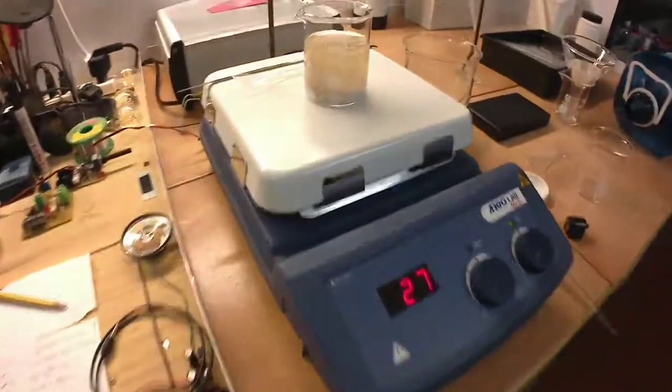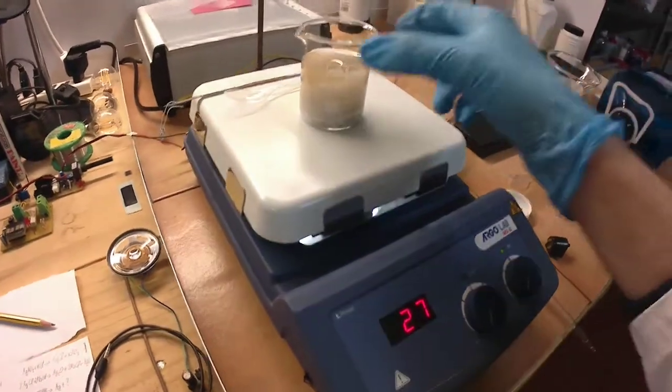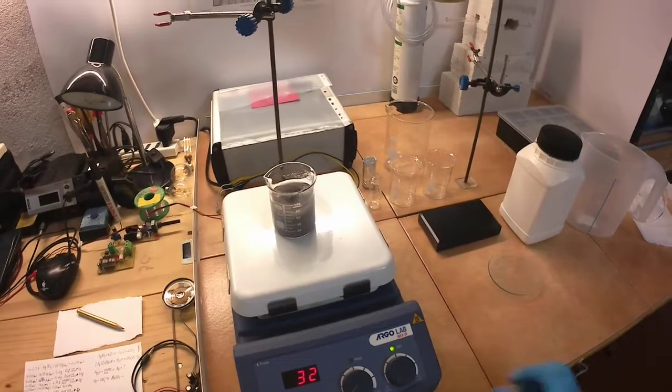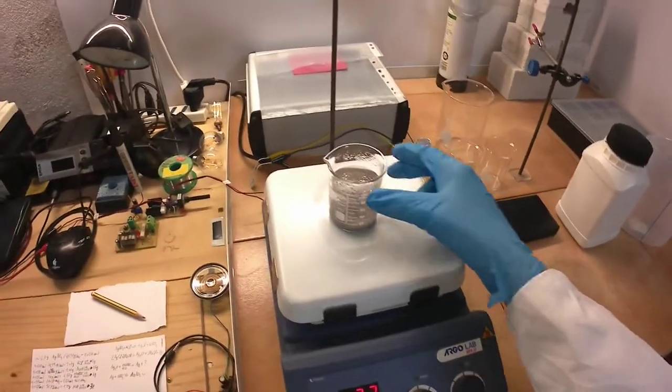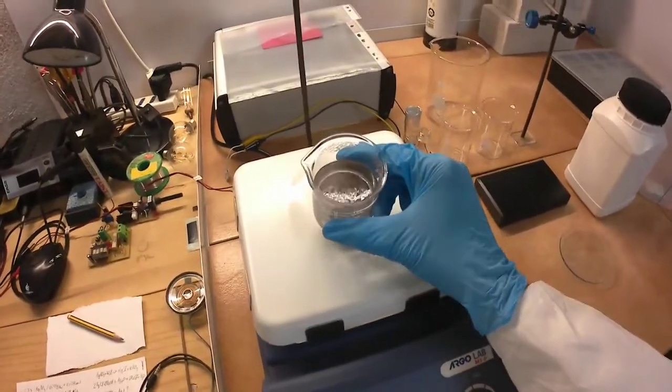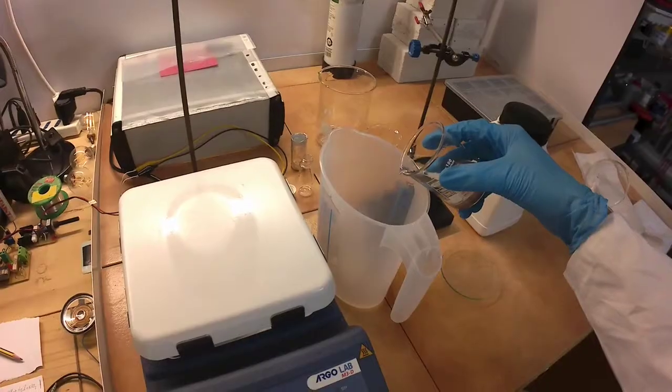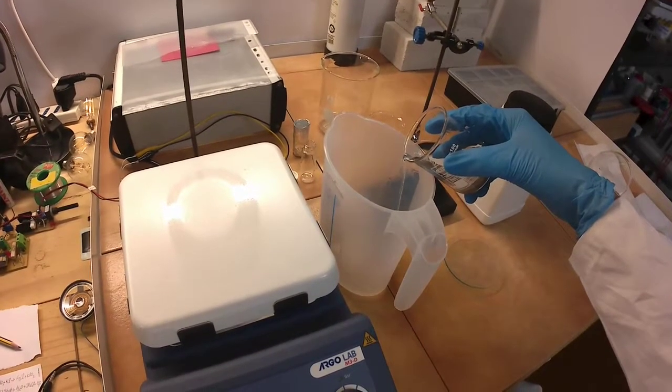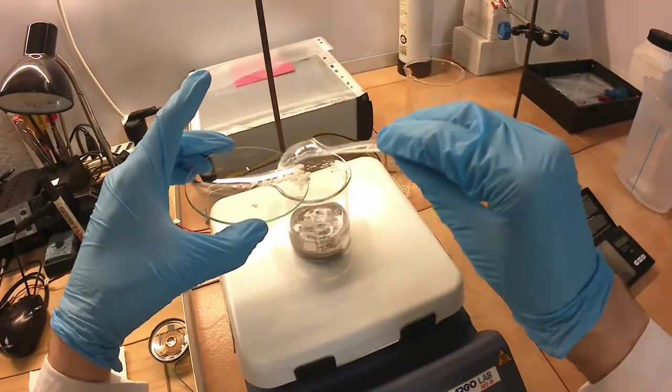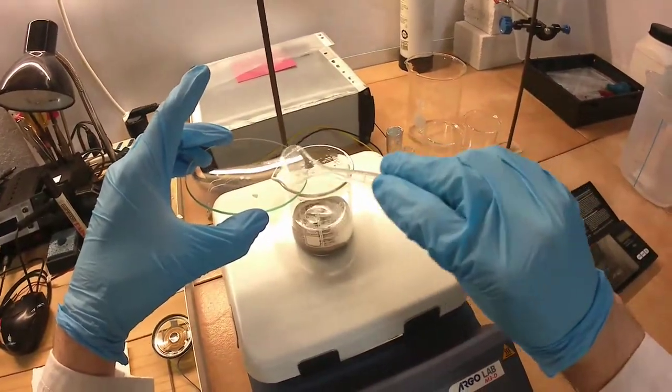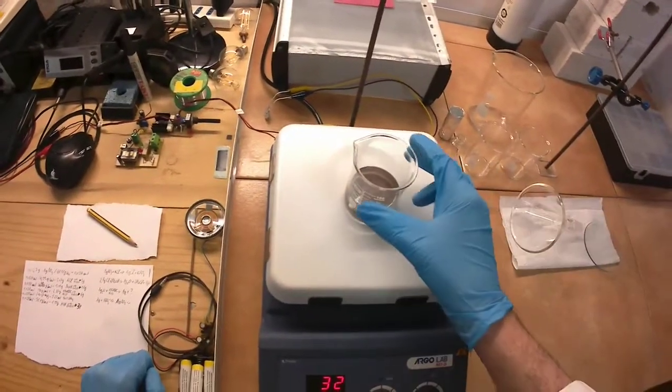At first, I stirred for an hour without heating, but the reaction seemed to progress too slowly, as I could see some white flakes of silver chloride. So I decanted some of the water to reduce the volume, added 3 more grams of hydroxide, and this time heated the beaker to 60 degrees. After a couple of hours, the reaction looked complete.